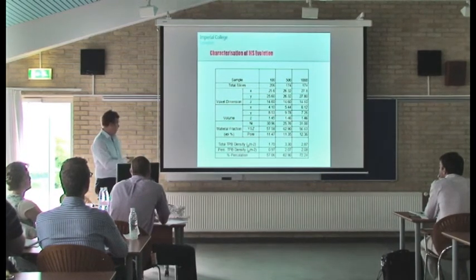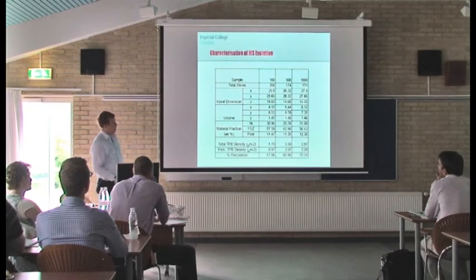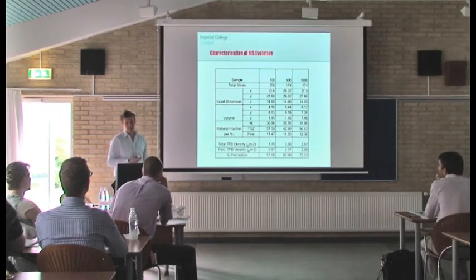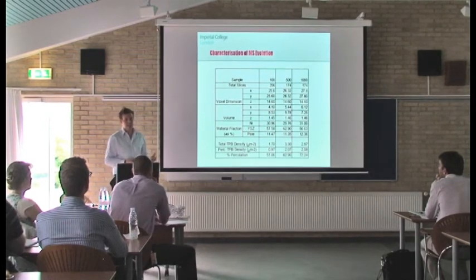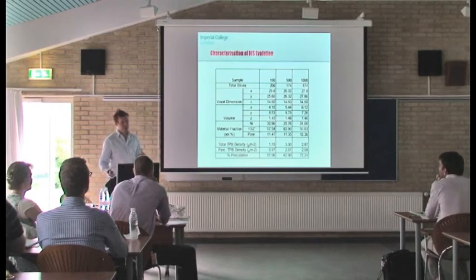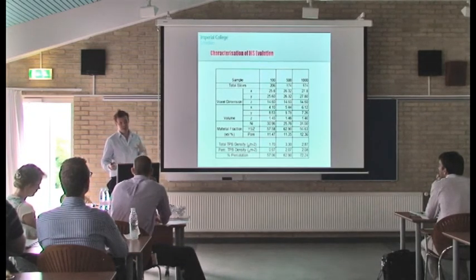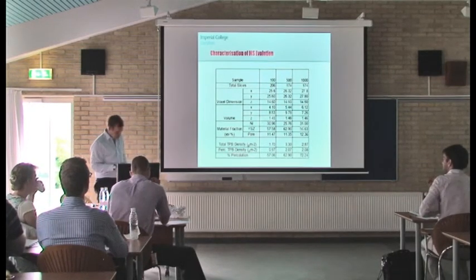And basically, if we take the total percolated triple phase boundary distribution, we're struggling really to see any effects as we age these samples. So this is 100, 500, 1,000 hours. Now, it's possibly because we didn't do large enough samples or enough samples, and equally it's possible that this is because it's a destructive technique, and therefore you'd expect there are going to be some statistical variations in the material microstructure. If we're looking at a dynamic evolution process, I think it's quite difficult to decouple these statistical interferences from the actual microstructural evolution process.